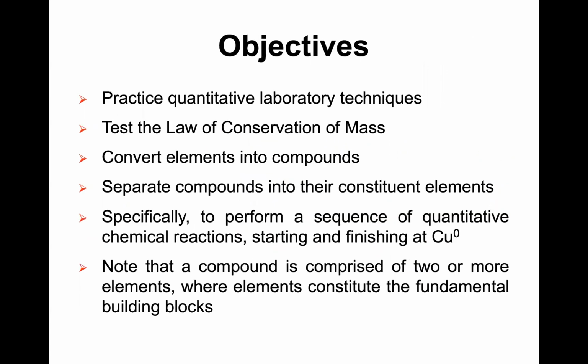Now, the objective of this lab is to practice quantitative laboratory techniques. So you will try to manipulate your lab so as to lose as little as possible. You don't want to lose any mass because you want a very high recovery yield, right? And also we will test the law of conservation of mass.